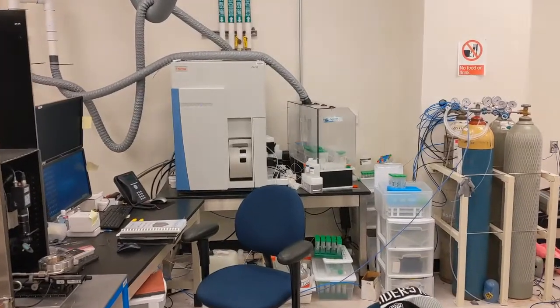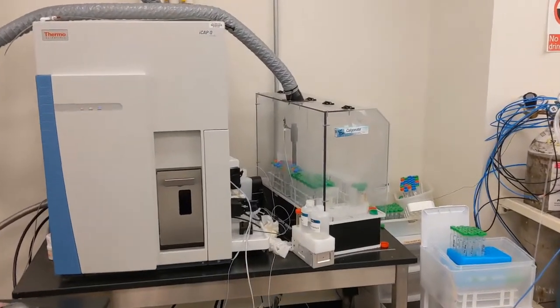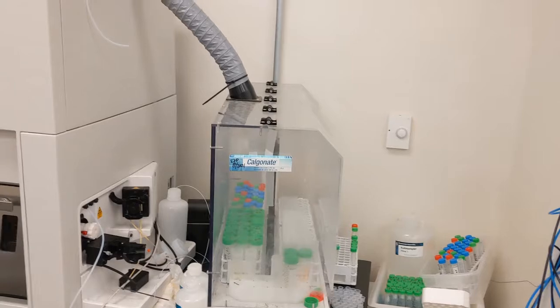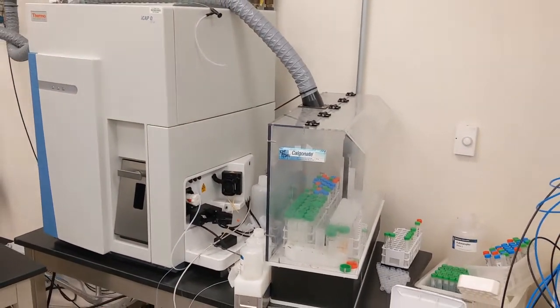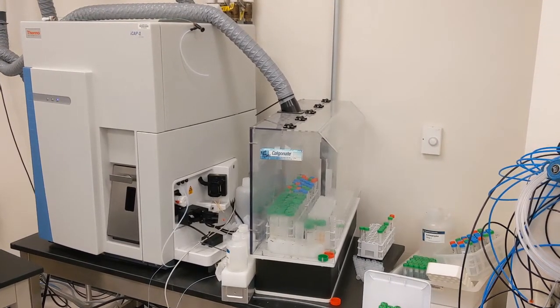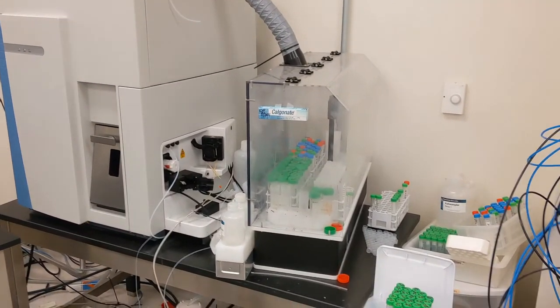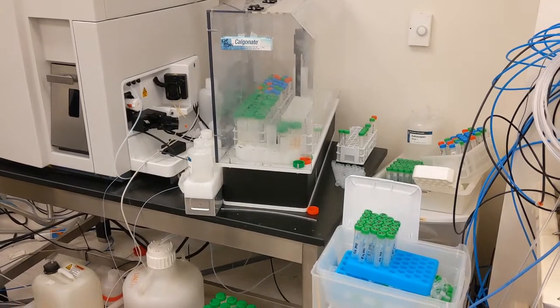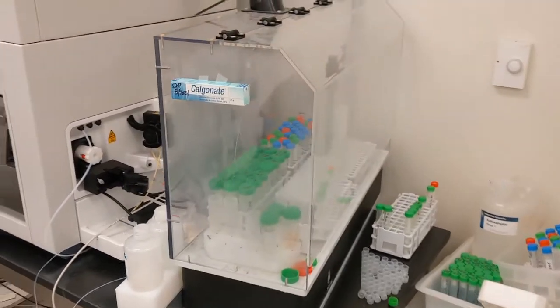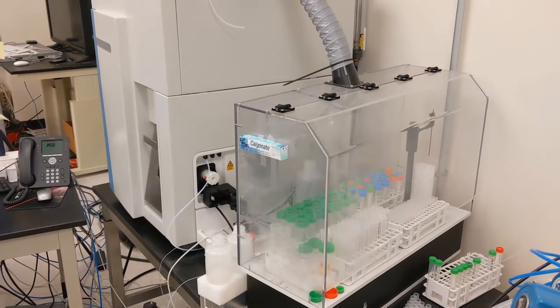This is the ICP-MS. It is a quadrupole mass spectrometer, and we use it to primarily measure the uranium, thorium, lead isotopes, as well as any other element that we might be interested in. We can use it in 2 different modes, the solution mode or the laser ablation mode. In solution mode, we are measuring the uranium and thorium isotopes in a dissolved crystal. This crystal we have already degassed for helium isotopes using the Alphachron or the SFT. The helium data, along with the uranium and thorium data, will give us a uranium and thorium and helium date.